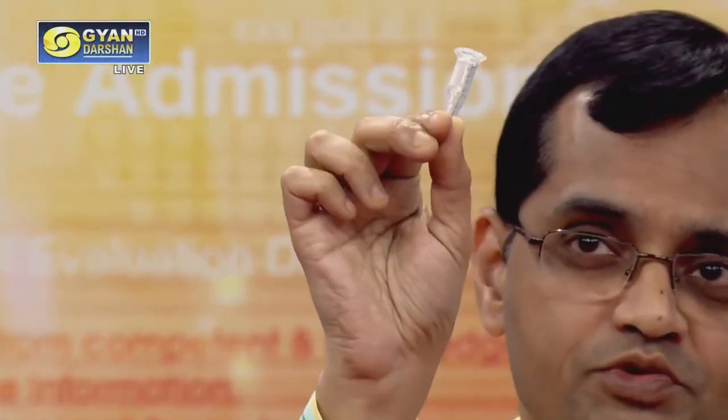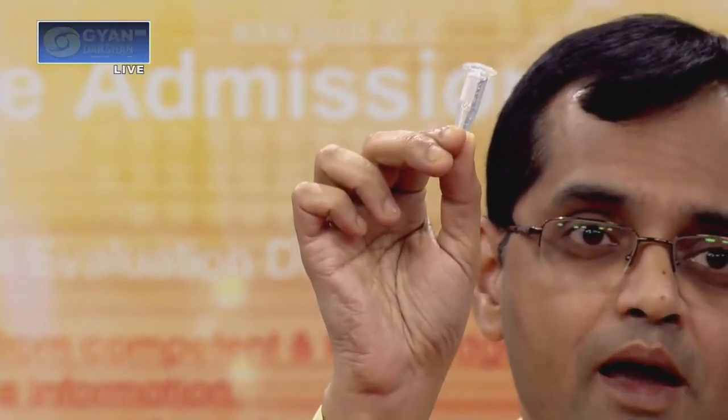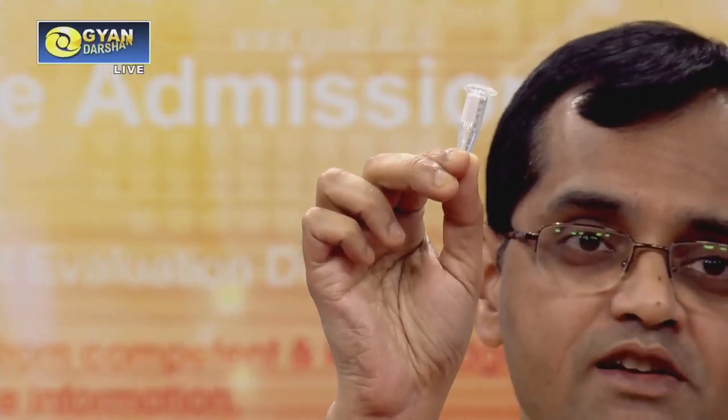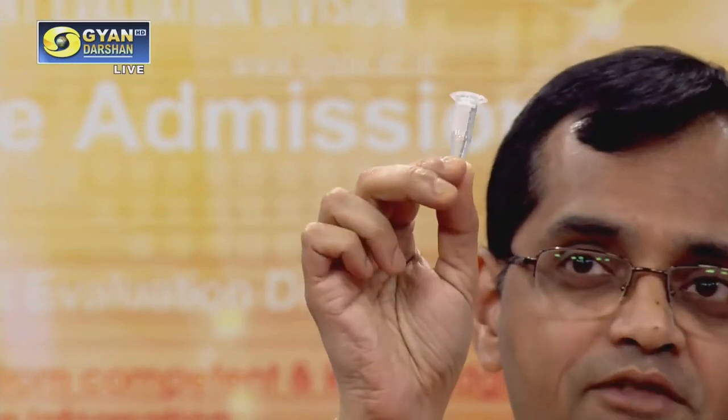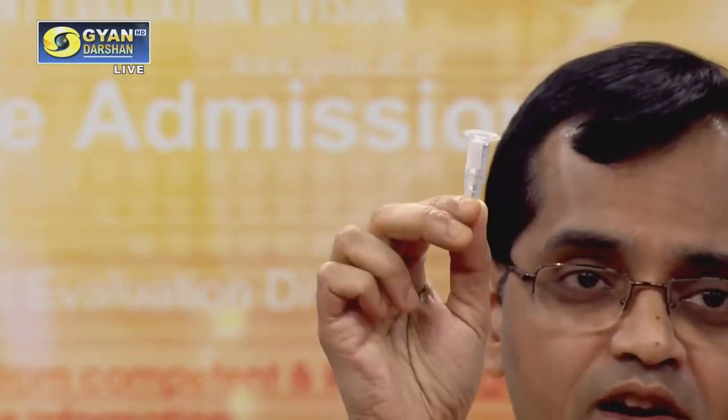The centrifuge machine can incorporate these kinds of tubes, as you can see, and these are called Eppendorf tubes. This one is of 1.5 ml capacity. Similarly, there are tubes of 2 ml capacity. Mind that you have to take the culture from the culture tube, pour the bacterial culture into the Eppendorf tubes, and then centrifuge it.